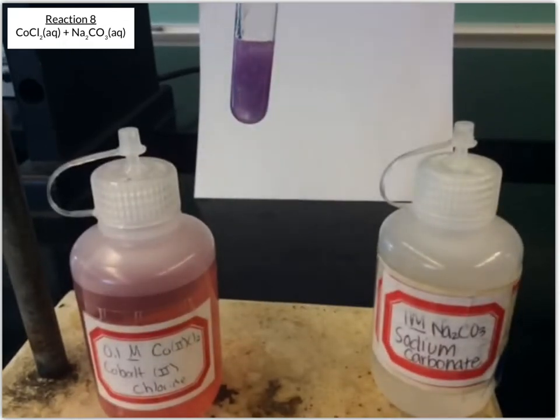And we definitely have a change. It immediately changed to a purplish color, and right now it looks a little swirly. I'll go ahead and mix it. So it looks like you've got some purple and almost some bluish color in there.